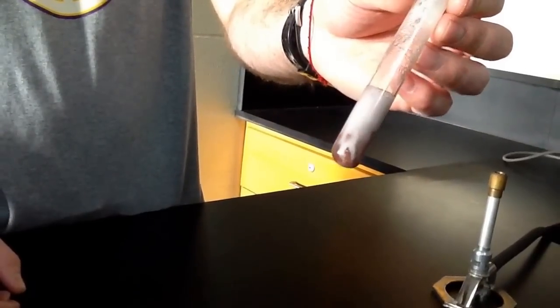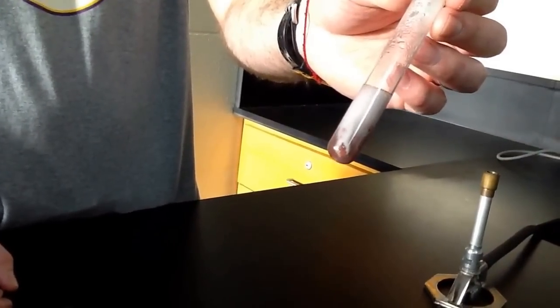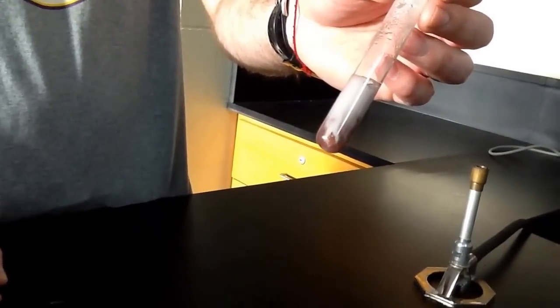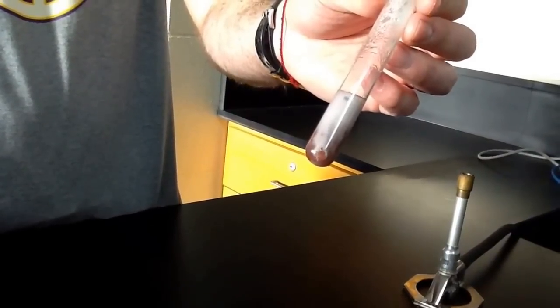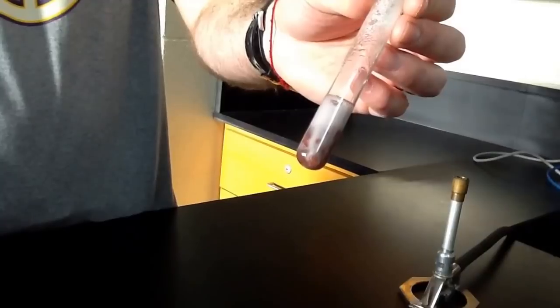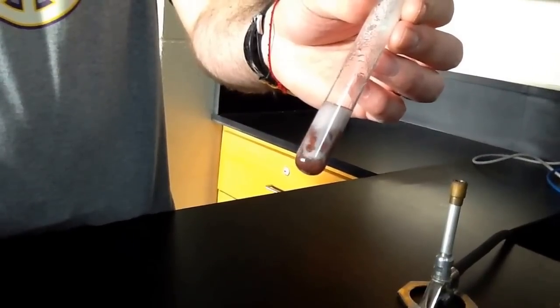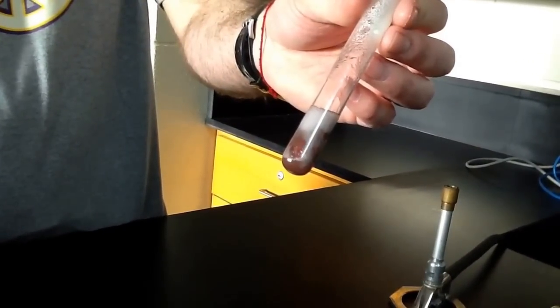And once this reaction goes to completion, what we'll also see is that the liquid went from that green-blue color to a clear color. All the copper that caused our green solution in the beginning is now clear because that copper is now turned into copper solid.